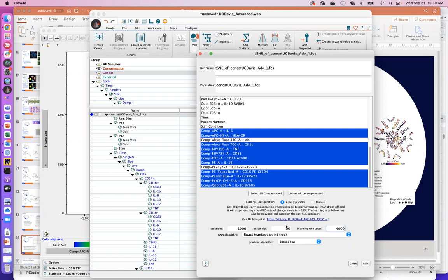The perplexity is a knob that controls the white space essentially that exists between the islands. If you need more white space, you may want to take the value up. However, I will say that perplexity is kind of a double-edged sword. Sometimes you can add too much value here. The islands will just essentially slam back towards one another. The default value here, I think, is pretty good.